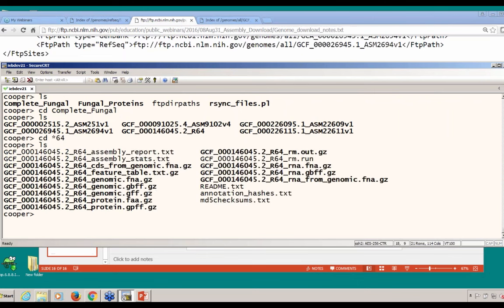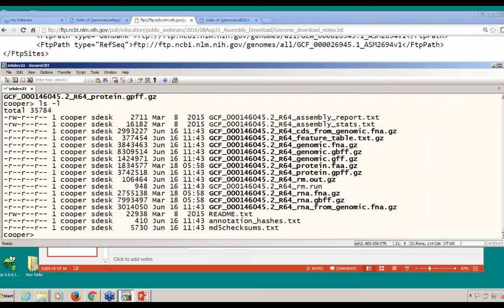I now have directories for all six complete fungal genomes that we saw using the Assembly resource. For example, going into the yeast directory — one of the switches I added was a level-one setting, which means I will not descend into subdirectories, but I could have changed the level to get the assembly_structure directory as well. The last example, which I will not run today, gets a particular file out of each one of these directories using wget. You can also do that with the Perl script included in the materials directory for this talk on the FTP site.